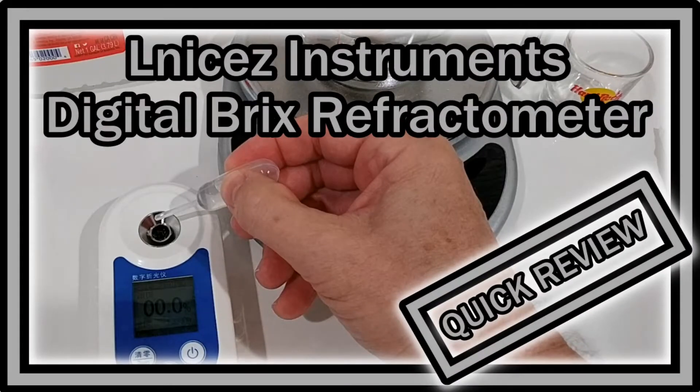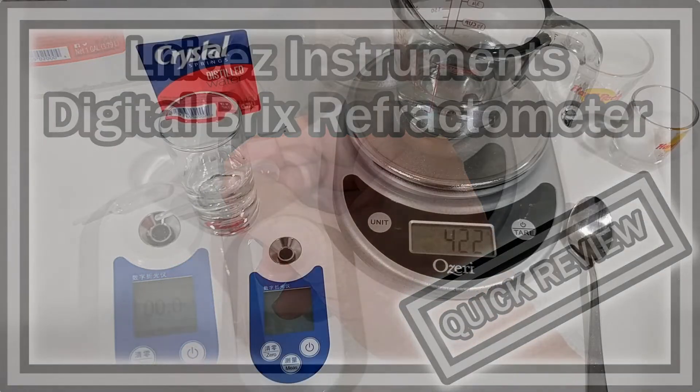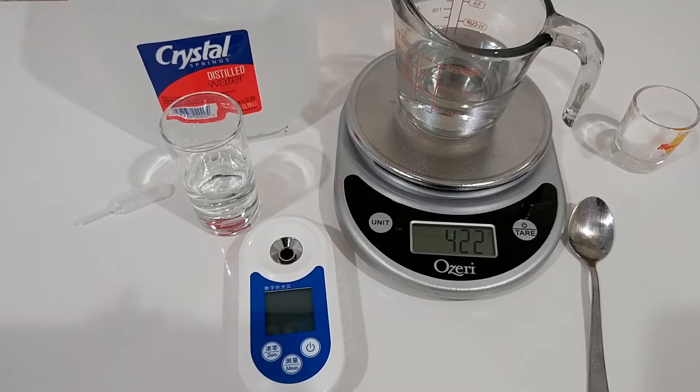Hi guys, welcome to a short video about this new L-Nice Refractometer. This is something we usually use for home brewing to measure the dissolved amount of sugar in a liquid. The possible range is between 0 and 55% for this device.